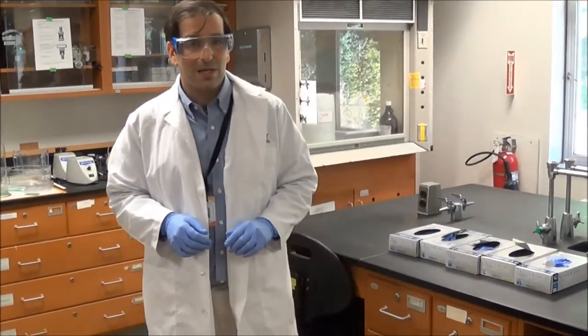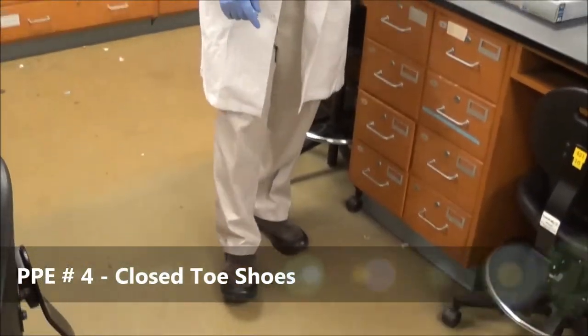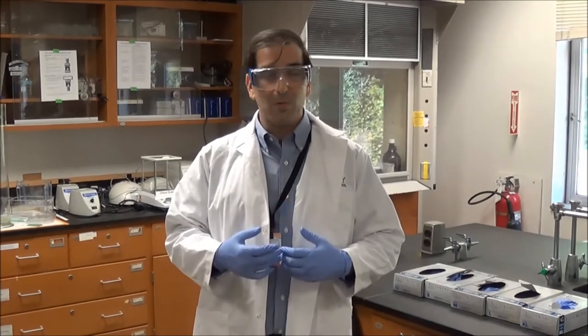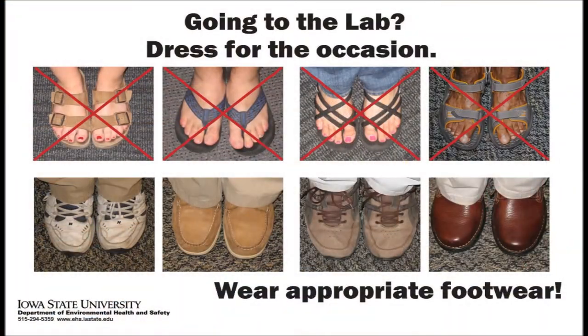The fourth item of personal protective equipment is one that we do not provide, and that's closed-toed shoes. I understand that especially in summer it's warm and people like to wear sandals or flip-flops. If that's the case, we'd ask you to come in whatever shoes you like, but please bring an extra pair of closed-toed shoes to the laboratory. Change into your closed-toed shoes for the lab, then change back when you leave — that way you're safe while you're here. These are some examples of appropriate and inappropriate footwear for the laboratory.